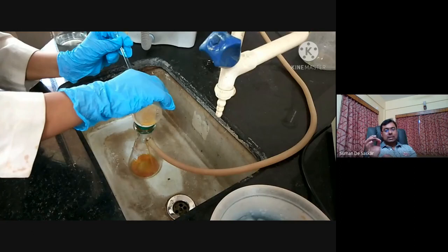Suppose in crystallization, sometimes it happens there is no crystal. You reduce the solution, and you are still not getting crystals. You cool it down, still no crystals. So this technique also people use. If you are making the compound for the second or third time, you may have a little amount from previous batches. You take a little solid and add it to the solution, and then it initiates the crystallization. Okay, so first there is one crystal, then a layer of crystals, and then a series of crystallization, and you get nice crystals of this.